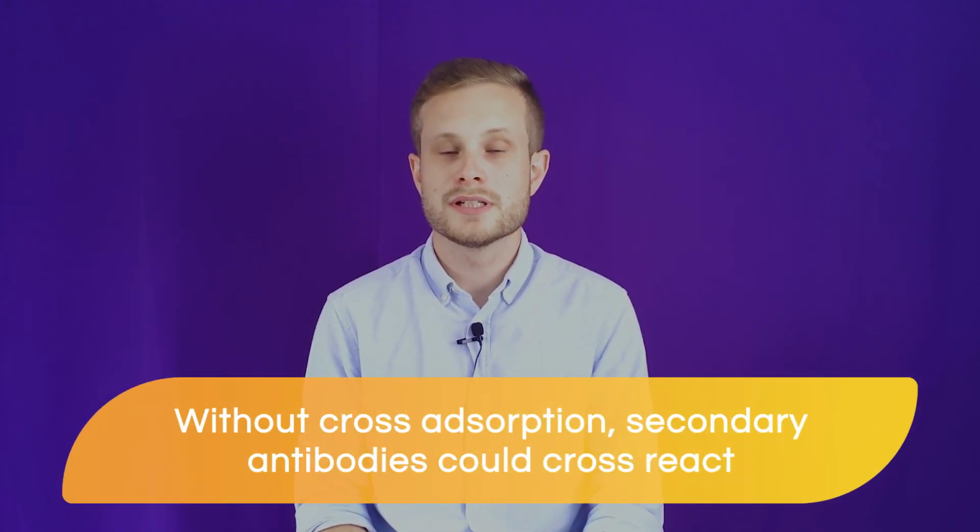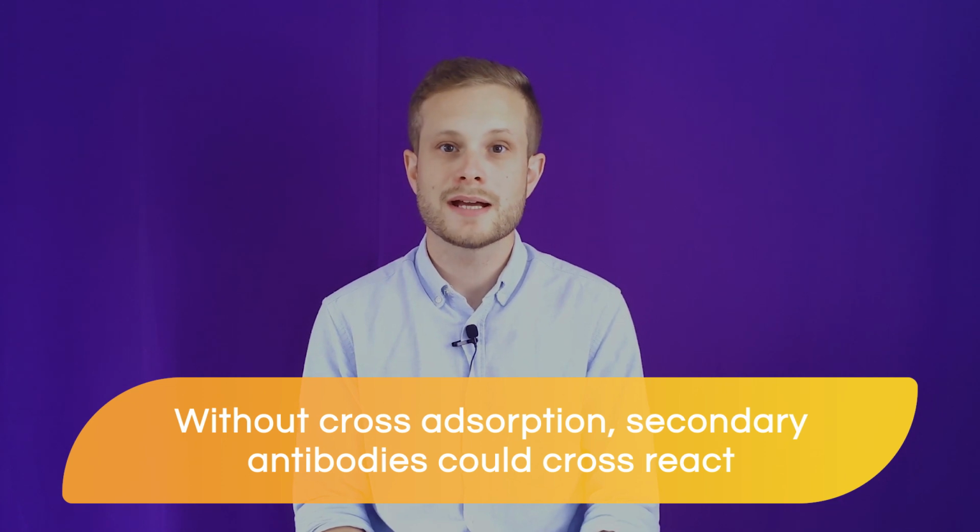This is critical for multiplex experiments because without cross-adsorption, secondary antibodies would recognize and bind to primary antibodies other than those to which they were intended. The result would be non-specific bands appearing in the other detection channel. Remember, if you're ever struggling to find a combination of primary and secondary antibodies which will work for you, you can always contact a LICOR expert for advice.